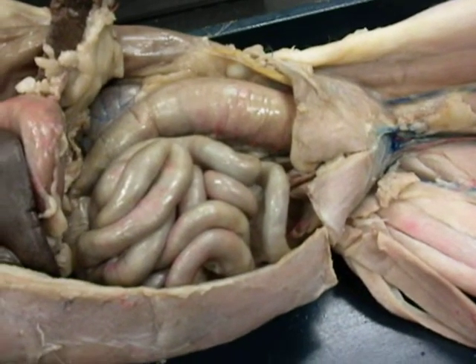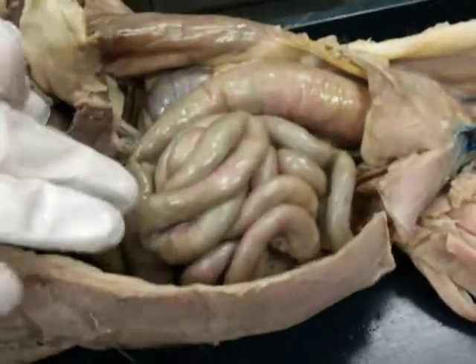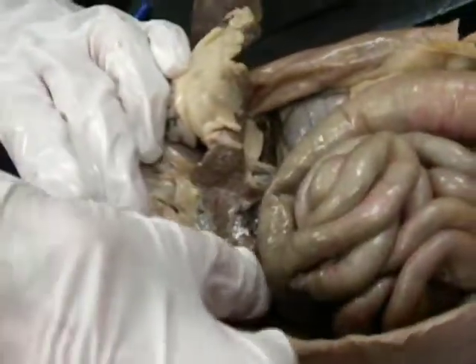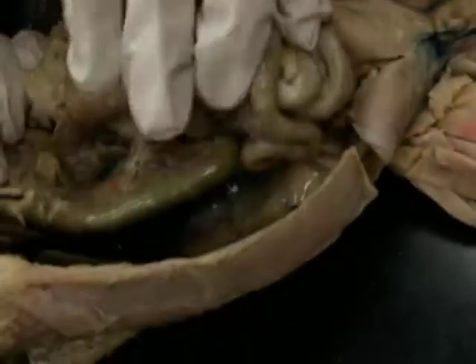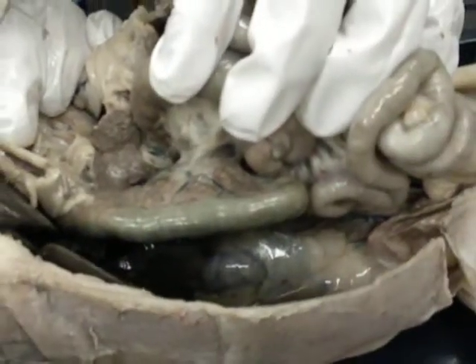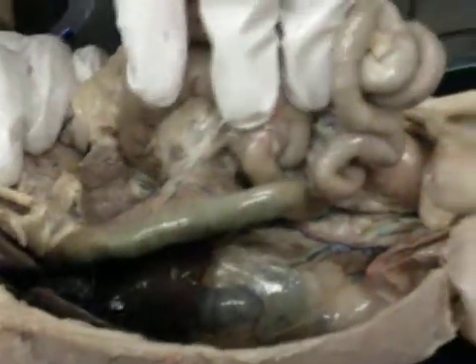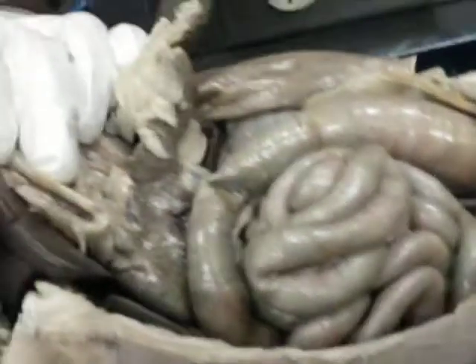Oh, and the pancreas we'll do next time, but I'll show you right now. At least I think I will on yours. Okay, see this dark meat kind of right here? There, and going down that way on the duodenum. The green is the bile that's in there. That's why it's green. On yours, that is not going to be green on everybody's, but on yours it's green because of bile. So all of this dark meat here is the pancreas.